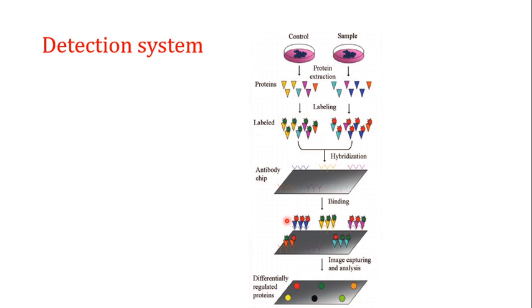What you mean by that is that you go through the laser system that I'll discuss in detail in the DNA microarray. So when you have added your samples to this protein chip, you are going to apply different lasers, and those particular lasers are then going to tell you about the presence of the particular protein at a particular position.